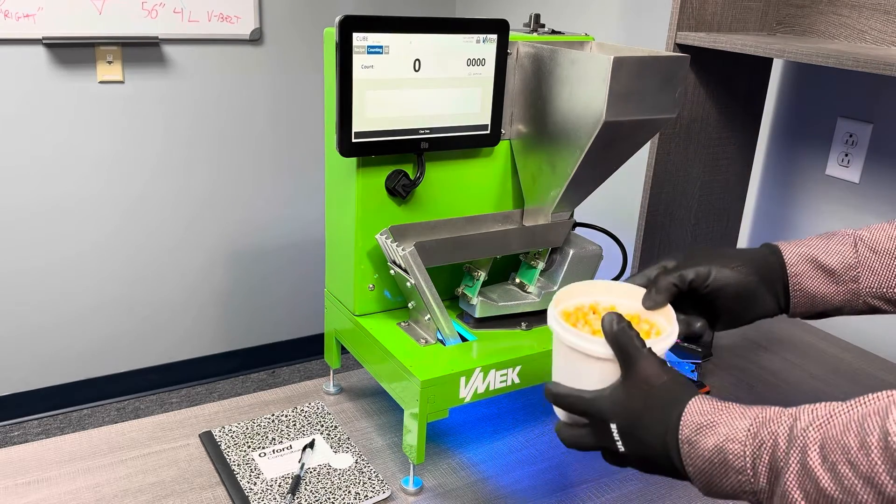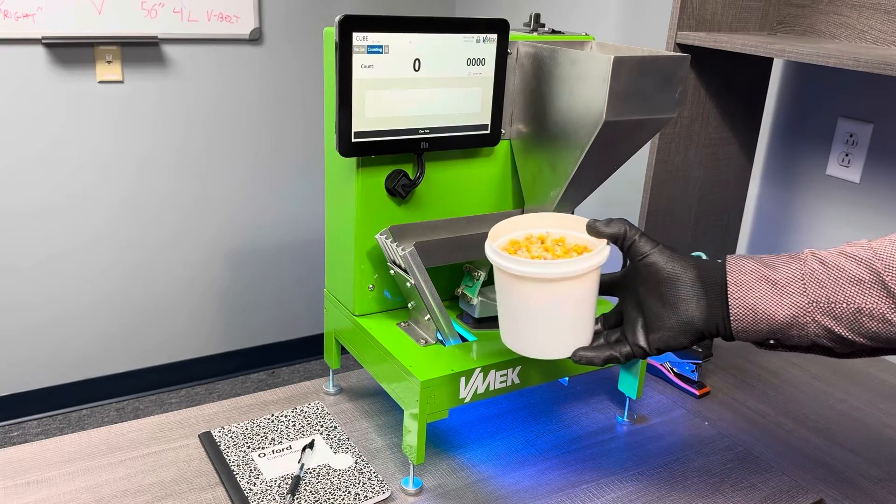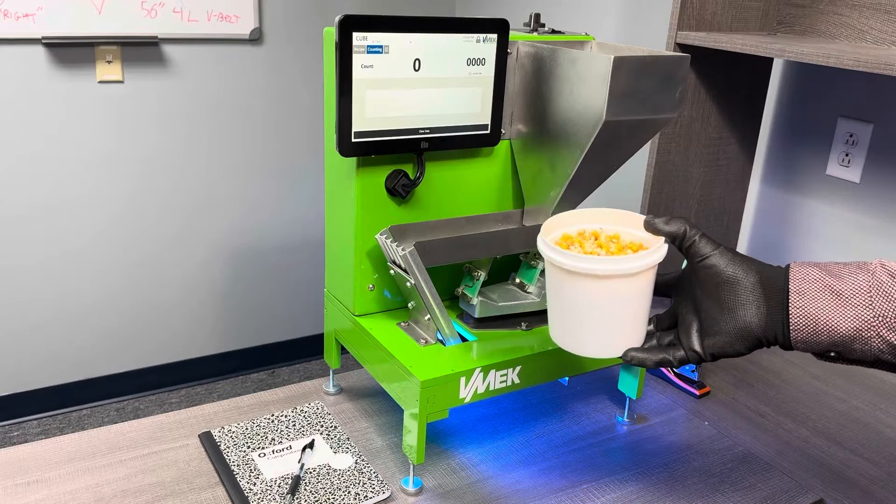It's also capable of running field crops like corn and soybeans at 100 seeds a second, and it does an excellent job with small seeds as well.